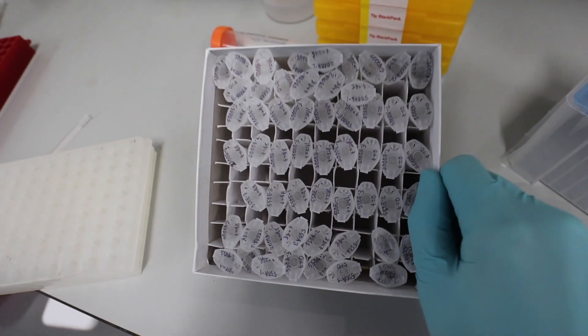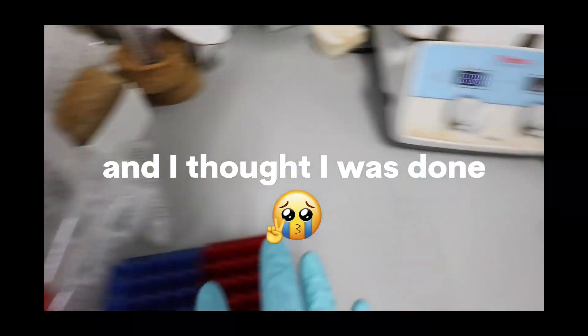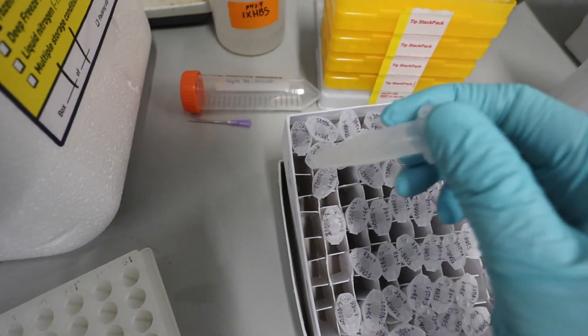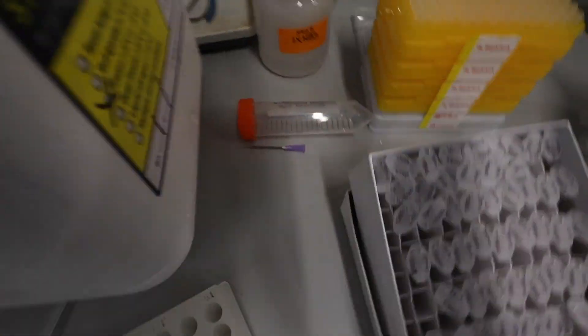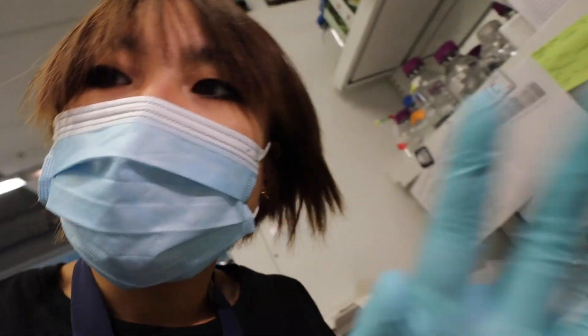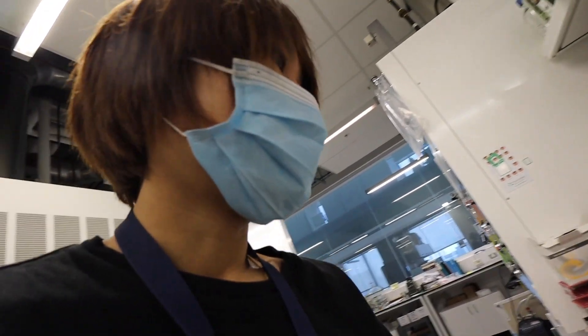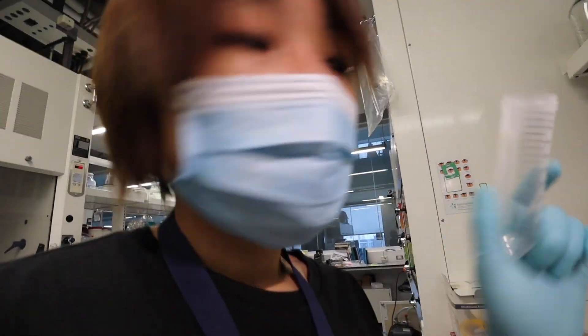Oh my gosh, look at all these samples that I have to lyophilize. These are the samples I lyophilized on Friday. Oh my gosh, so silly. I'm gonna transfer these samples — they're in the negative 20 so it's not as frozen as they can be. Let's put dry ice over here and let it sit for a little bit. Okay, so I poked holes into all of them. I have two of these. I'm gonna take it over there now and put them into their tubes and then put them onto the lyophilizer.